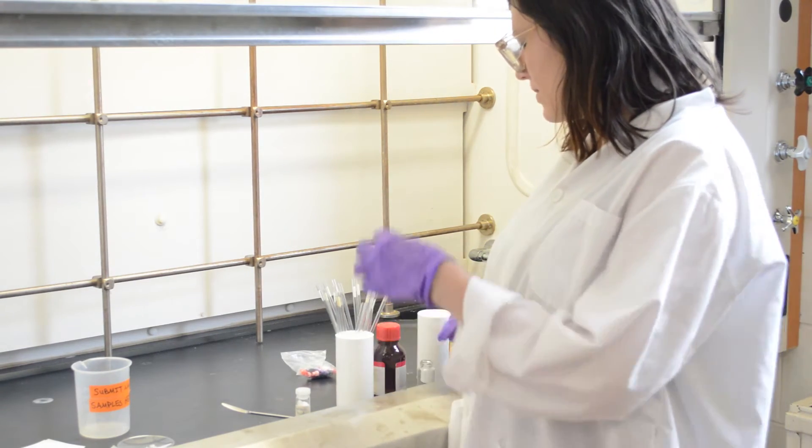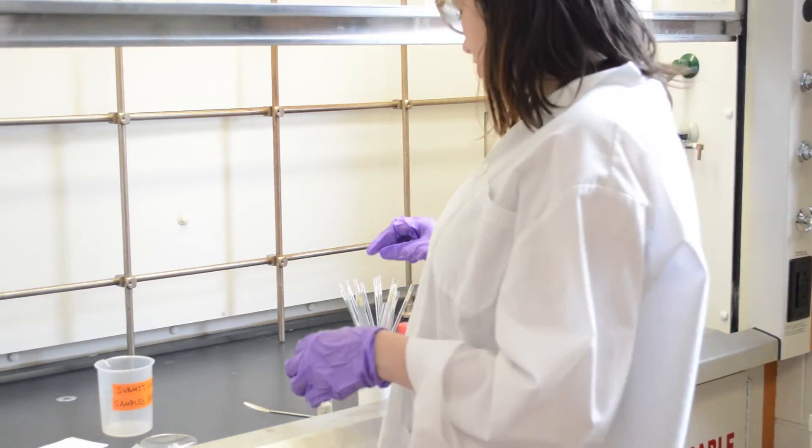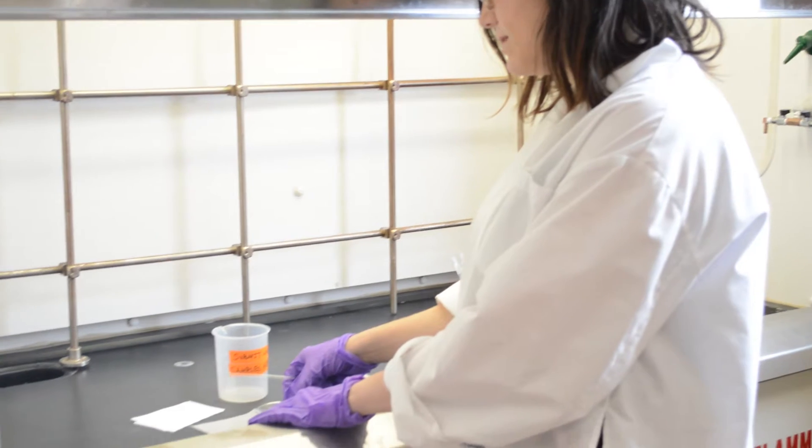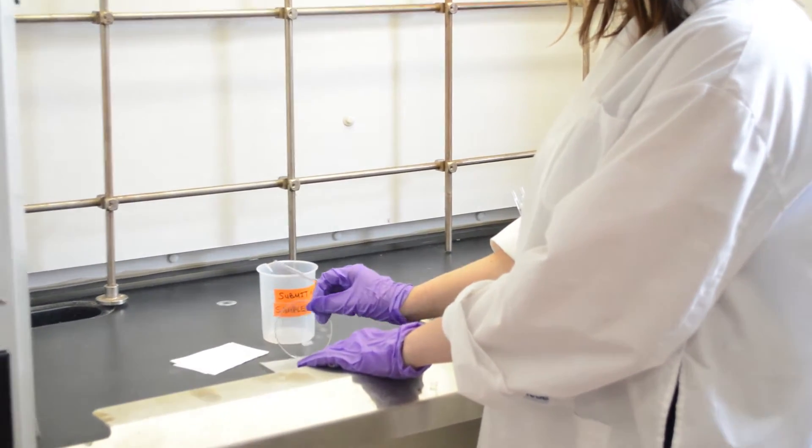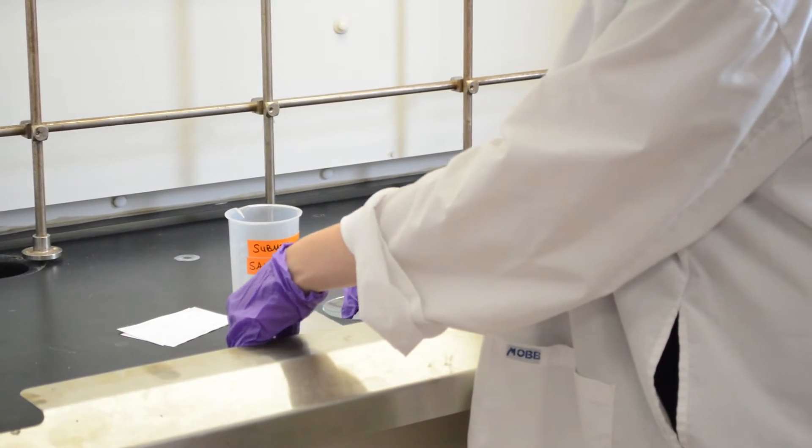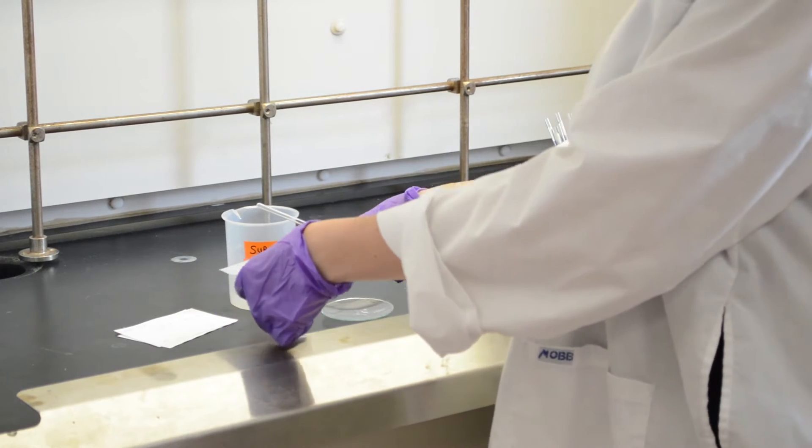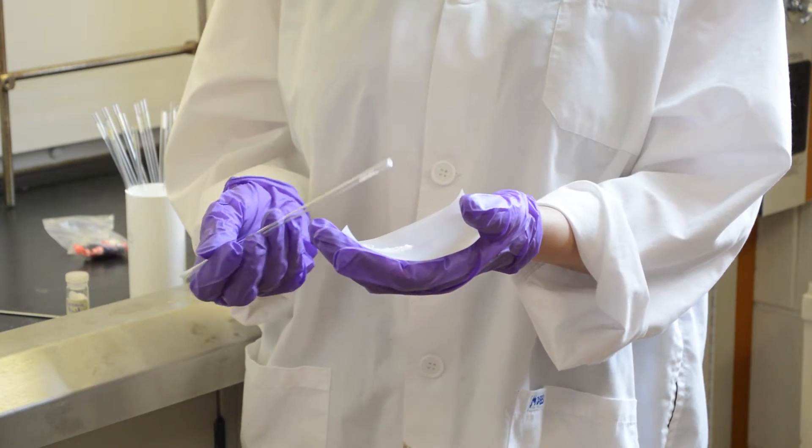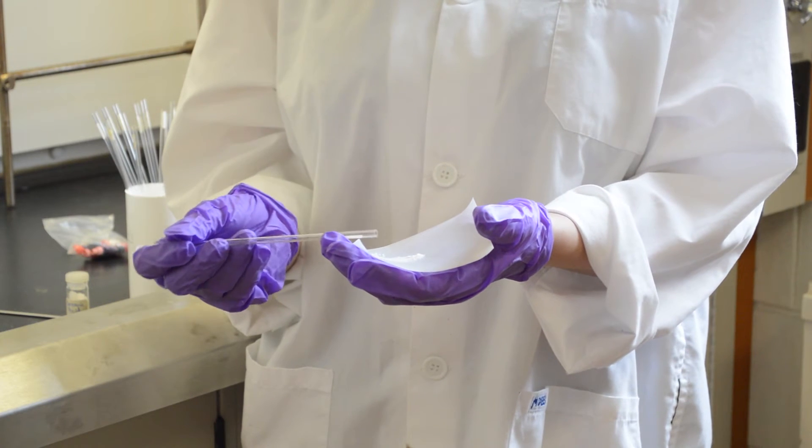The other method that we use is to just take this glass NMR tube, put a bit of sample on a weighing paper, and then take some of the solid and scoop it into the NMR tube.